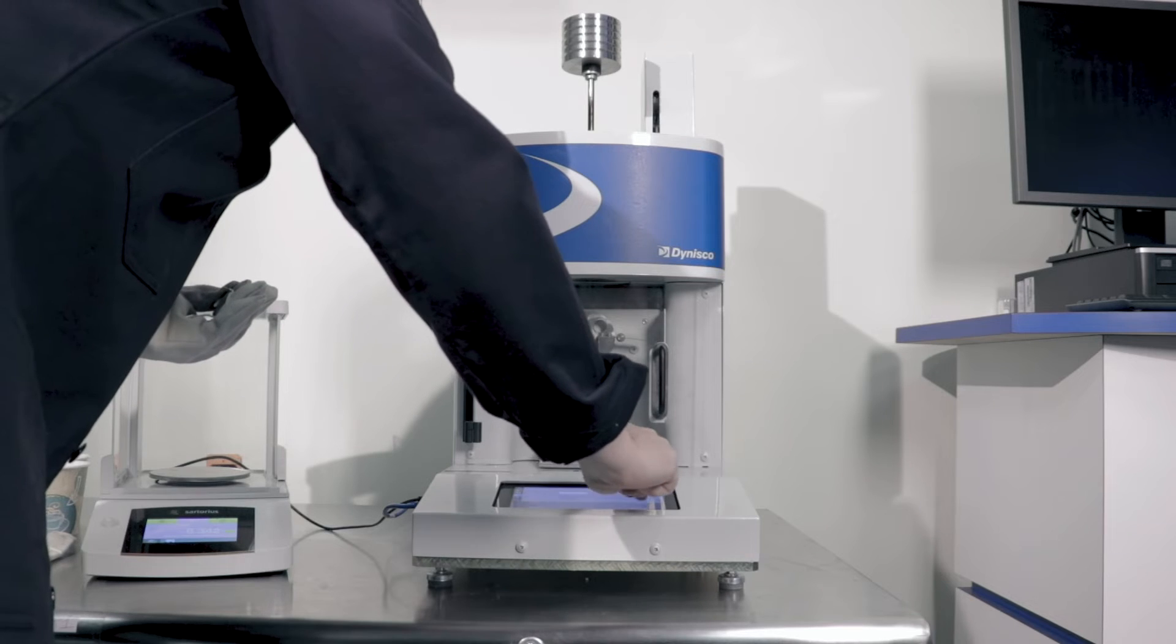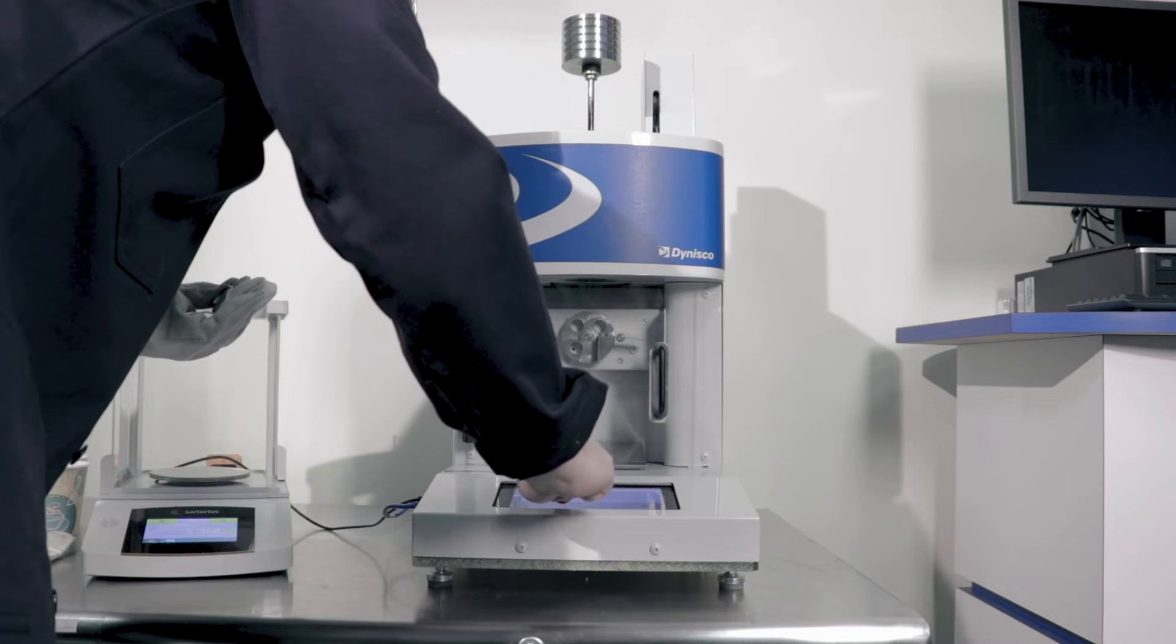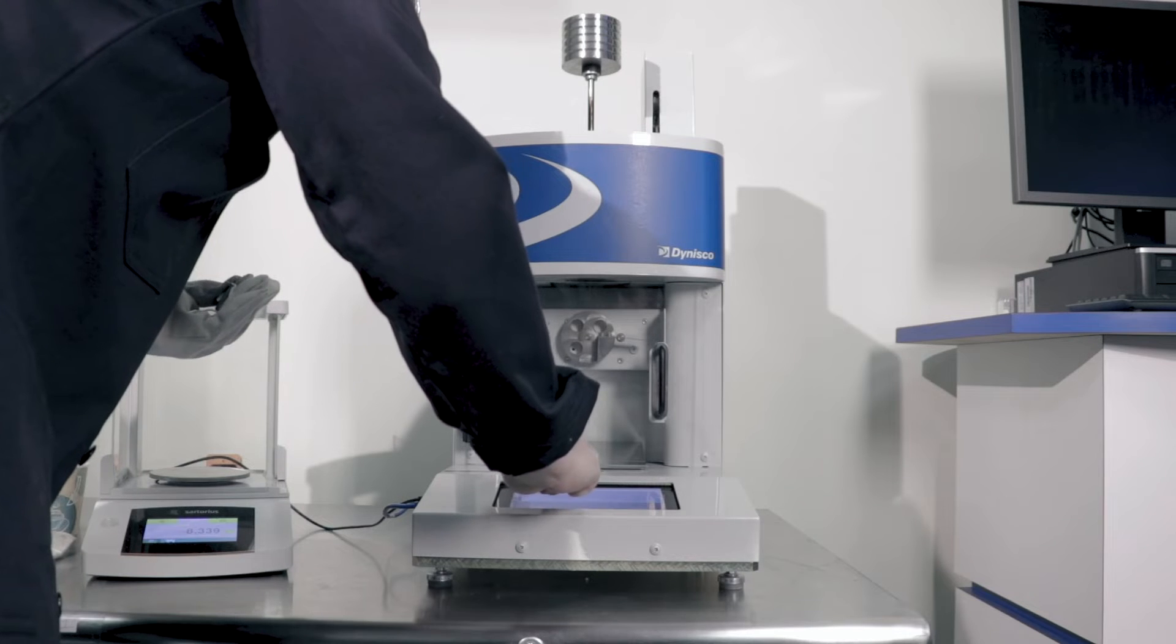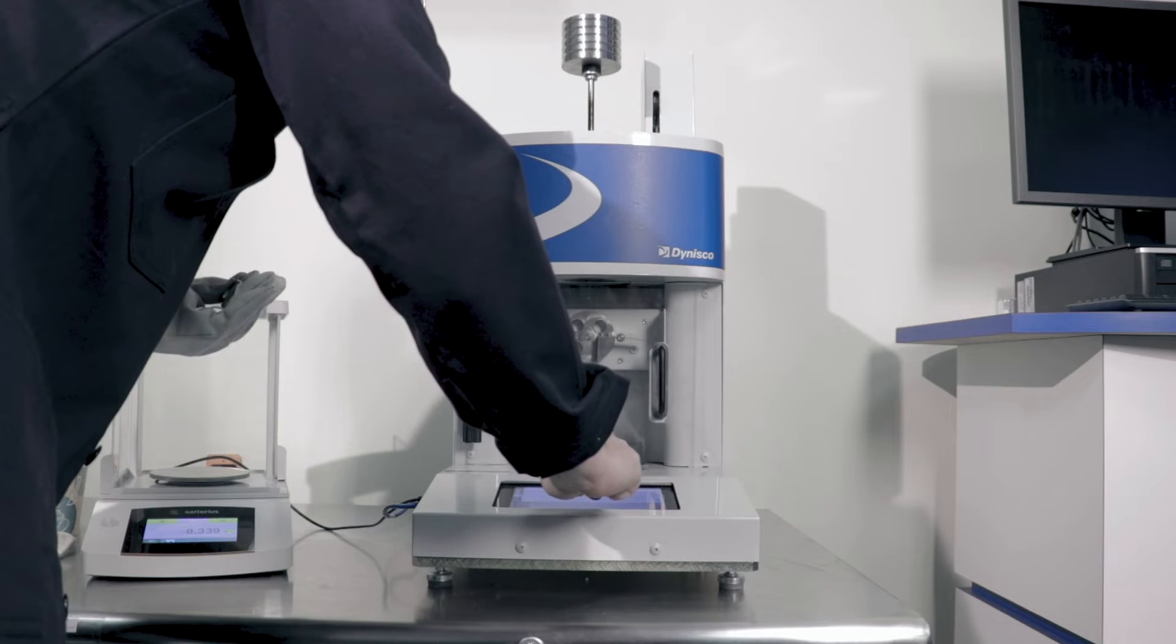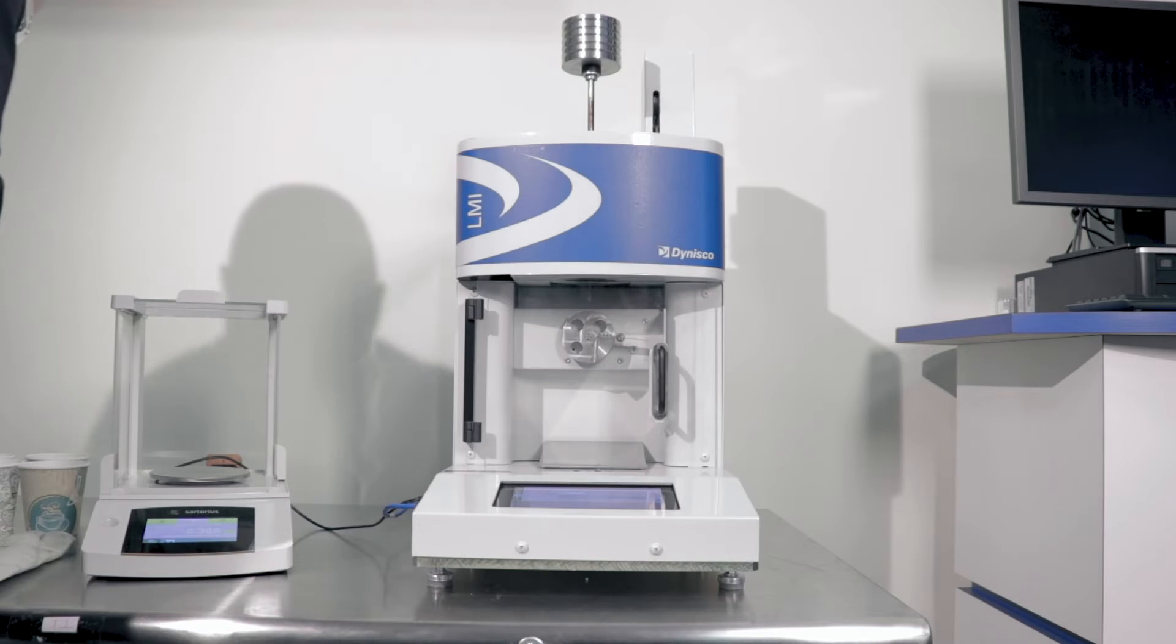First, the attendant sets the parameters for the test based on the conditions found in the relevant ASTM standard, respective ISO standard, or the supply specifications for the polymer by using the machine's built-in user interface.